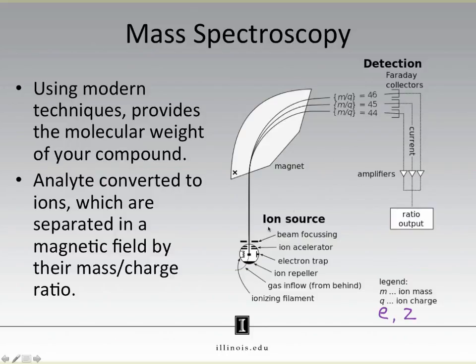You have an ion source that makes ions. These ions are then sent into an area containing magnets. These magnets then sort, separate, and filter out the different kinds of ions, and they do so using the mass to charge ratio. If our detector detects a particular mass to charge ratio, it lets us know via the spectrum output.